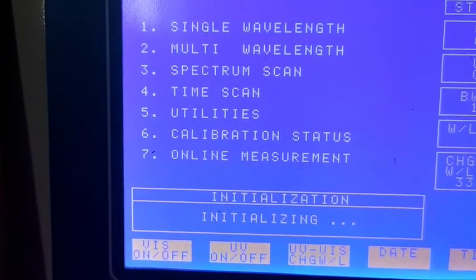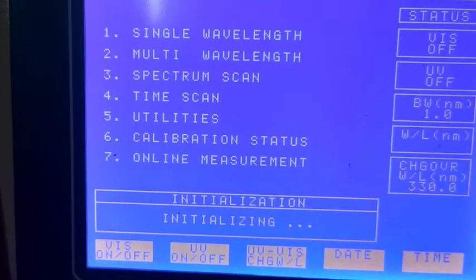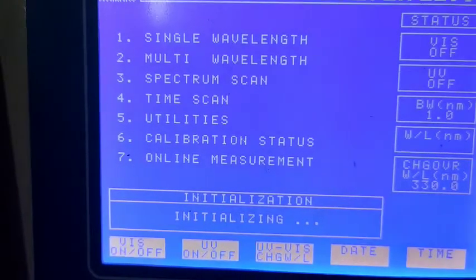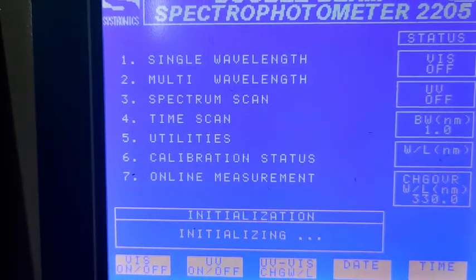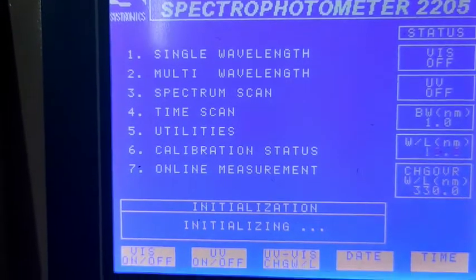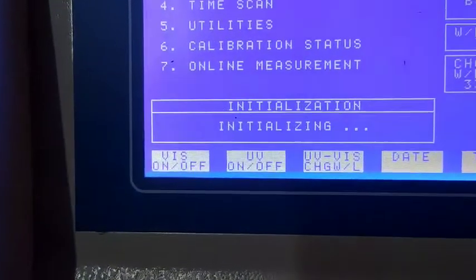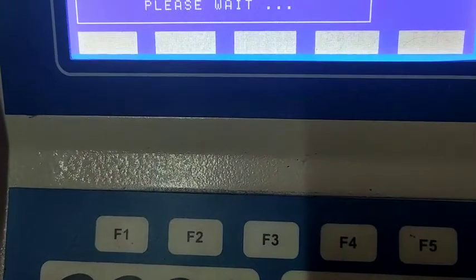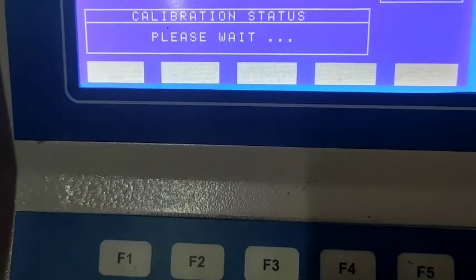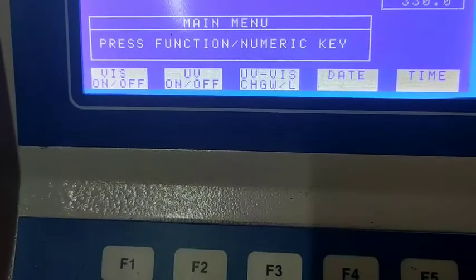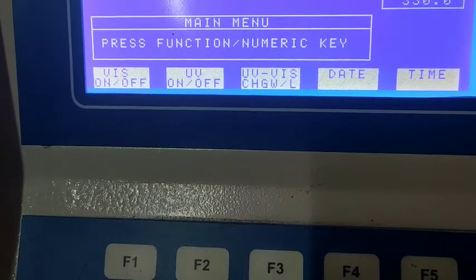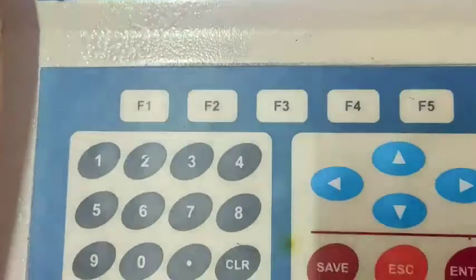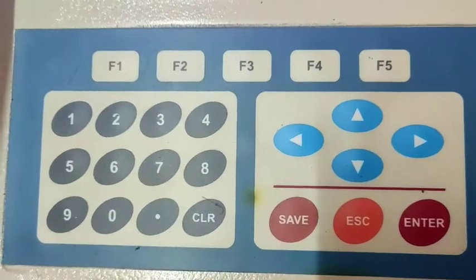At the bottom of the display you can see five more options: visible on/off (visible lamp), UV on/off (UV lamp), UV-visible, date and time. You can check the status of which lamp is on and which is not. There are five keys at the bottom corresponding to these five display items — the first corresponds to F1, UV on to F2, UV-visible to F3, and so on.